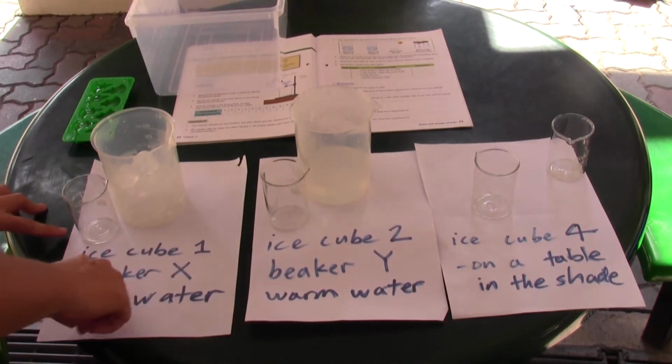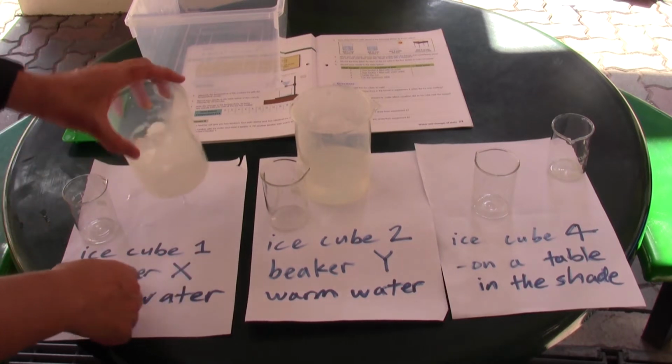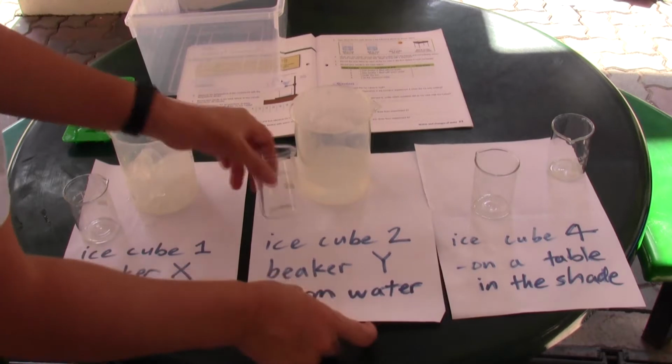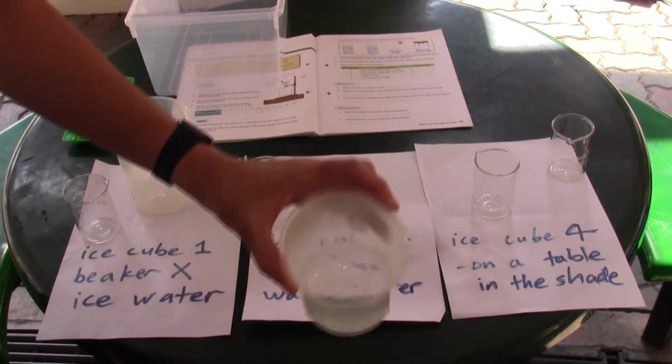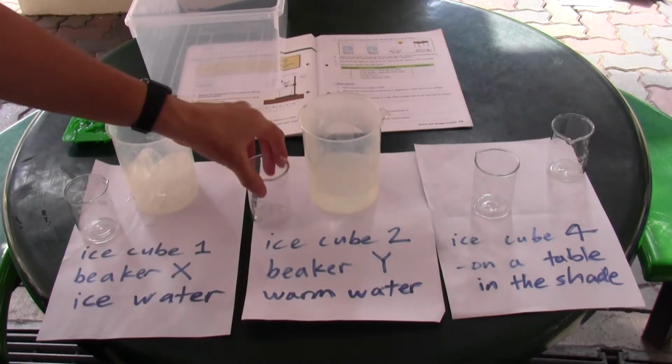Here we have ice cube 1 in beaker X, which has ice water in it. Then we have ice cube number 2. I will put it in this beaker which has warm water in it. You can see the condensation from the warm water.